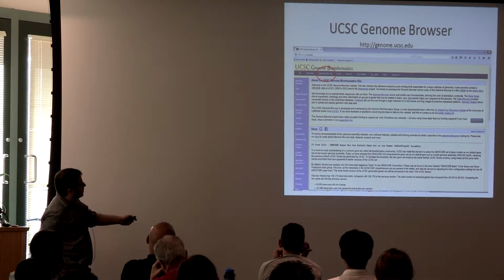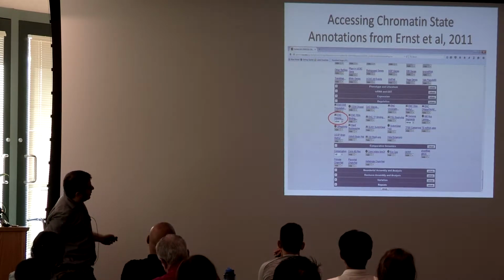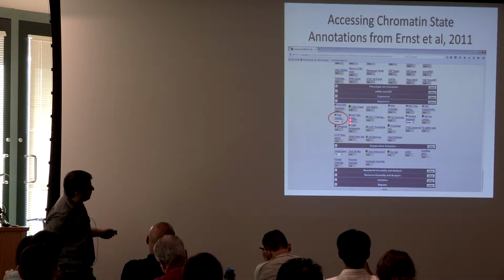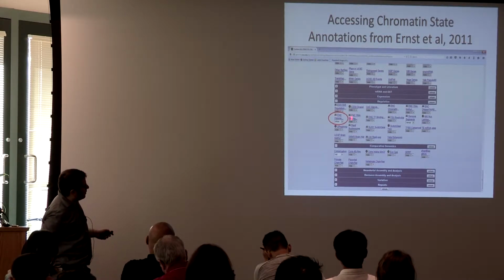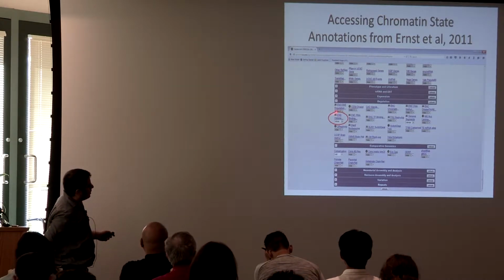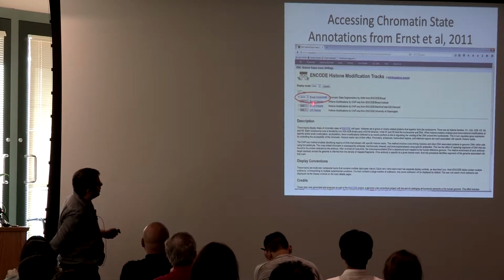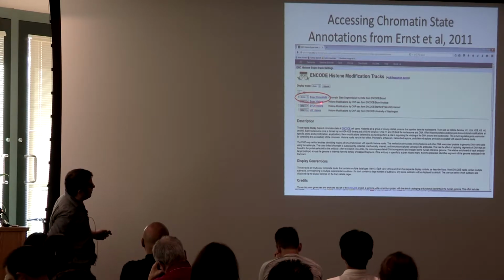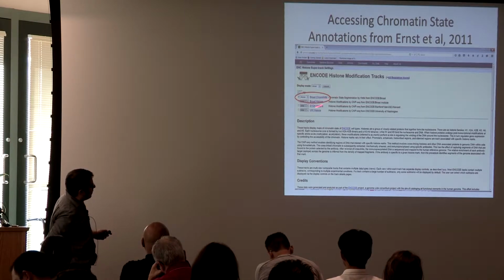And if you go there, then you click Genome Browser. And then under the regulation section, so in the browser, you would scroll down, and they have these different categories. So it would be under regulation. There's this window, ENCODE histone modifications, and you would want to change this to show. And then you would also follow this hyperlink. And then there's going to be a set of 3 different histone sets from different groups. If you wanted to see the raw histone signal that went into this, you would click the Broad histone.